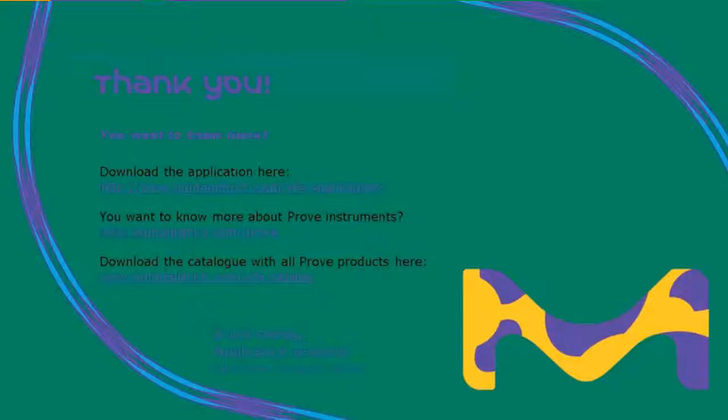Okay. Another question we've received is, does Merck offer the standards required to prepare a calibration for low-level analysis? Yes, we do. We offer certified reference standards in concentrations of 0.1, 0.5, and 1 milligram per liter of silicate. And from these standards, you could make standards in any range that you needed to dilute them to.